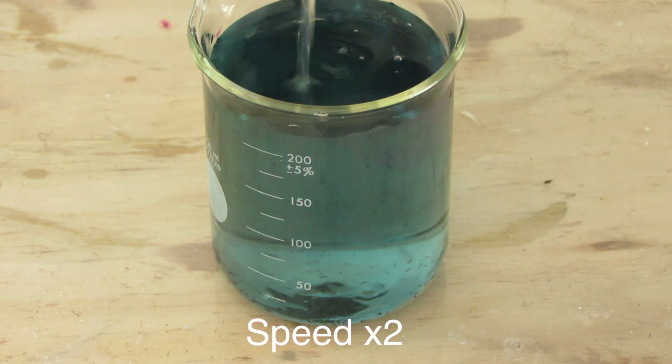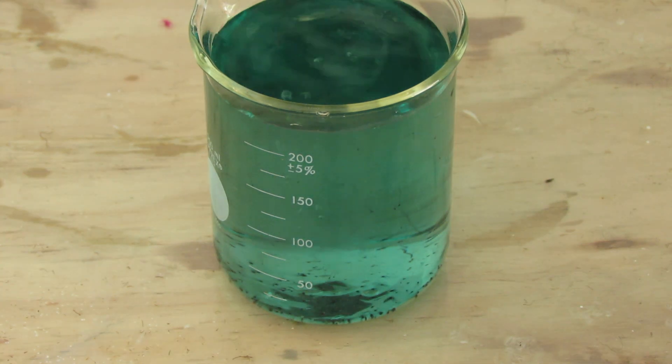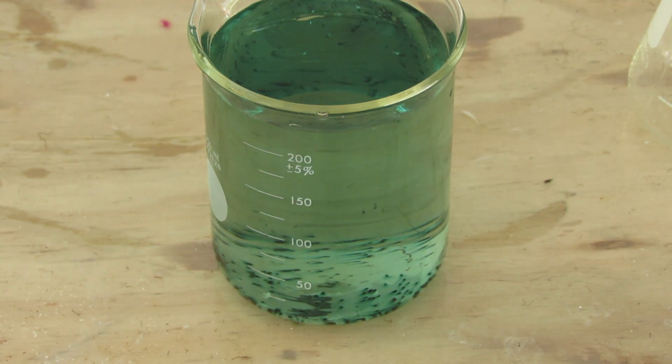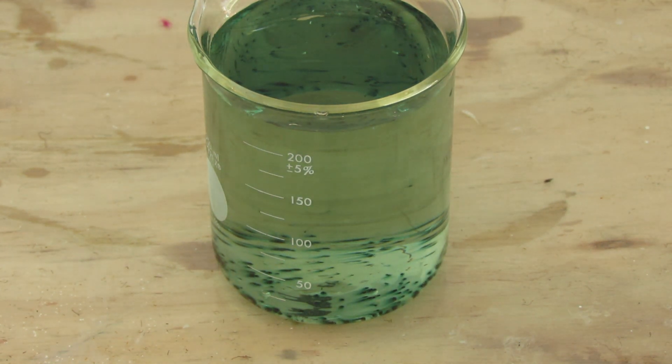When you're ready, mix the two solutions and the color changing will begin. First it will go from pink to green, and then from green to yellow. Then if it is left to sit for long enough, it will go clear.